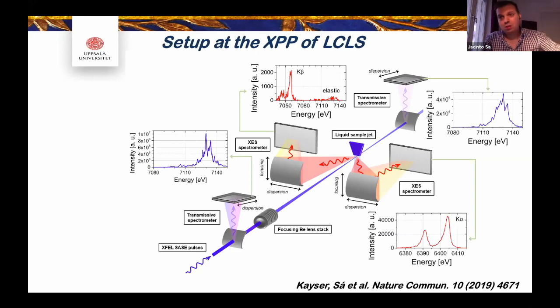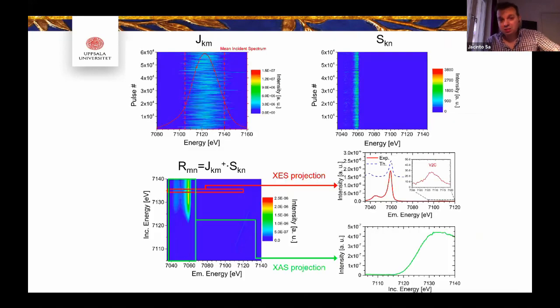Of course, now with the new free electron laser in Hamburg, with a high repetition rate, a more advanced jet needs to be done in order that you actually refresh the sample every single shot. So this is how it looks like. This is a zoom of the pulses coming out of the free electron laser. I should say that they were so interested in looking at this because they had never actually seen the pulse before in real time.